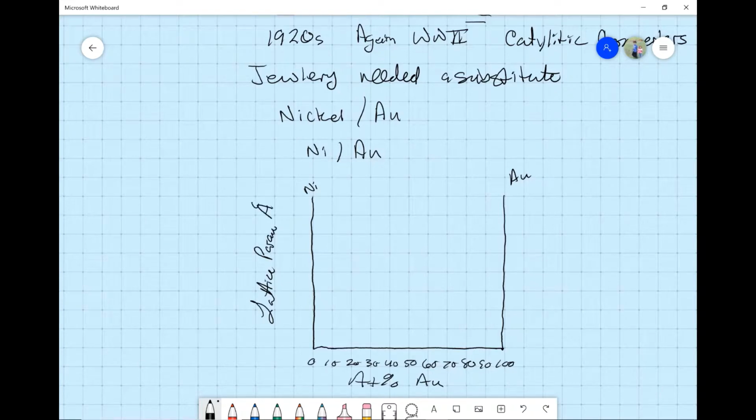And it's going to be in angstroms, okay? And A, lattice parameter A. So nickel, the lattice parameter of nickel is... and the lattice parameter of gold is 4.08. So let's just say this was 3, this is 3.5, and this is roughly 4. And so we can put it slightly higher. I'm trying to be somewhat approximate using my fake graph paper here.